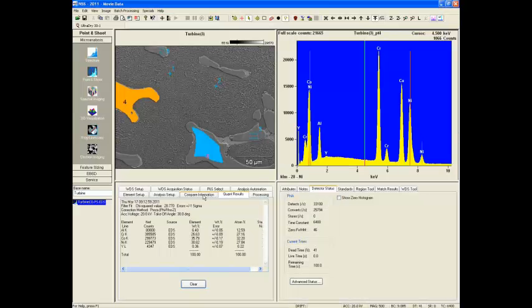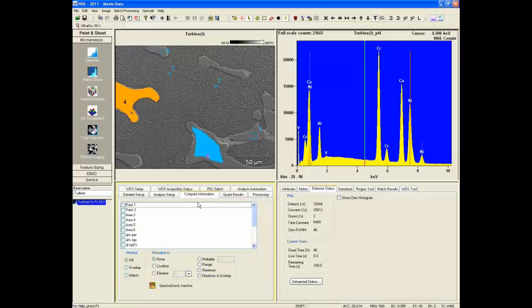We can also go to a comparison mode, and we can compare by overlapping spectra at different points. So point number 4 is the primary data spectrum that is listed. That would be the glob material. Let us overlay it with point number 1, which would be the speckled shapes that are in there.